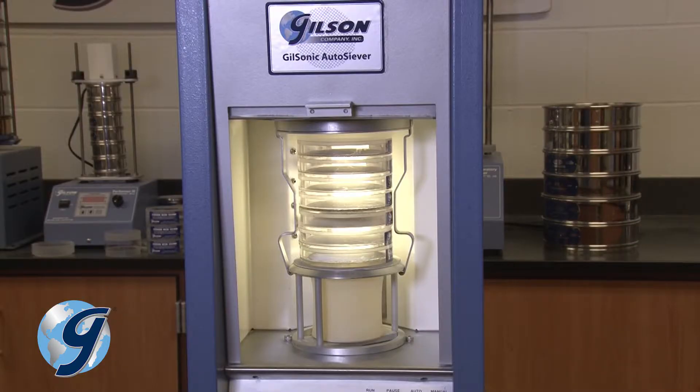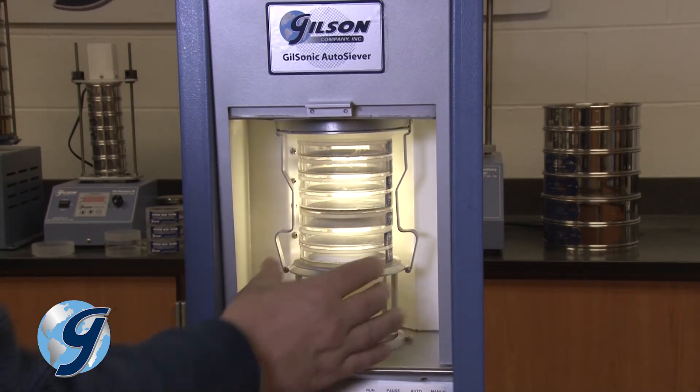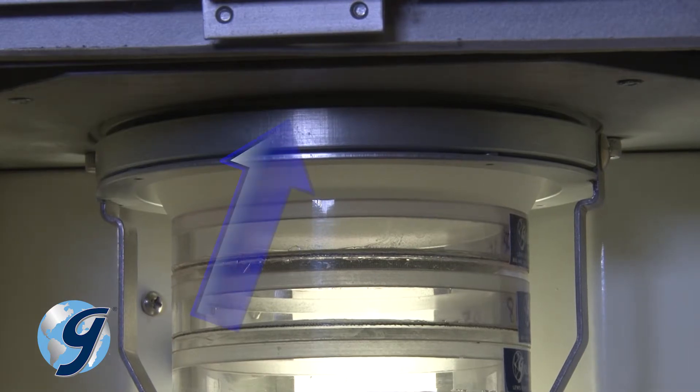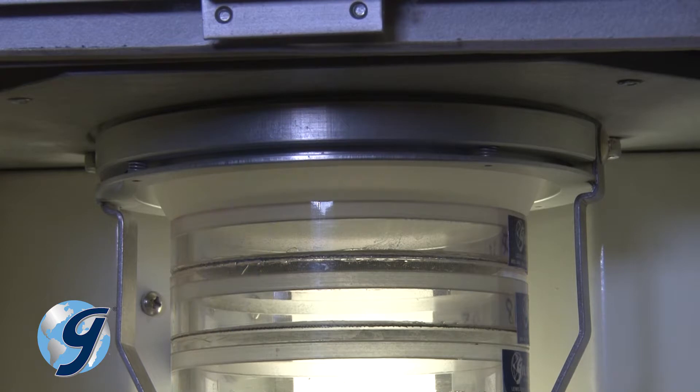Release the sieve stack locking bars by inserting the thumb and forefinger inside the bars at the bottom of the stack and forcing them outward. When the locking bars are released, the stack assembly will rise upward and the top of the column lock should fit into the stack locking ring located at the top of the sieving chamber, thereby securing the sieve stack in place.